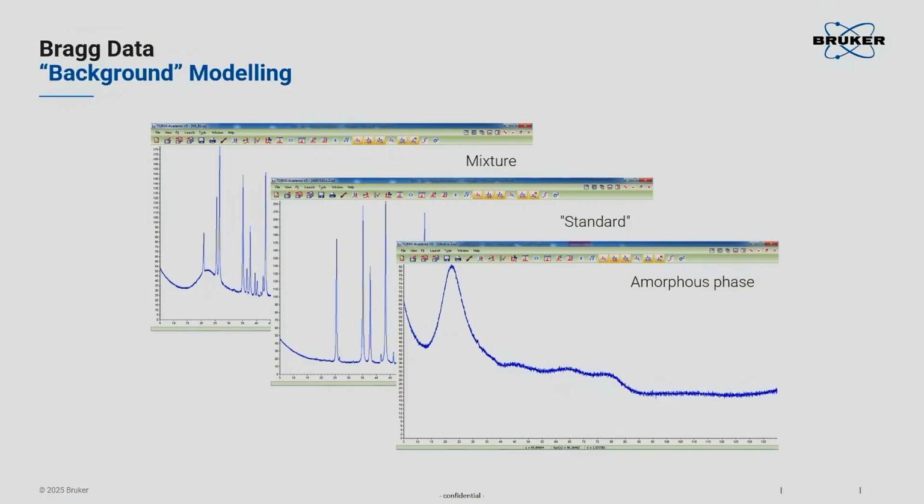If you have the amorphous phase pure, you have already done a very important step, because that would allow you very easily to model the instrument, the intensity distribution of the amorphous phase. And if I have the intensity distribution of the amorphous phase, then I also have the possibility to refine that in subsequent refinement. Still, I have the background of the instrument here.